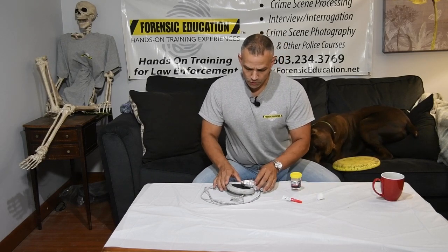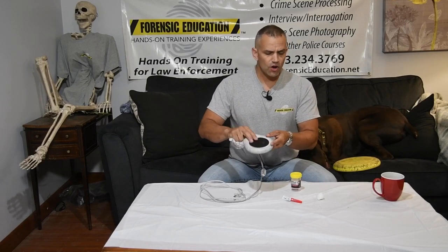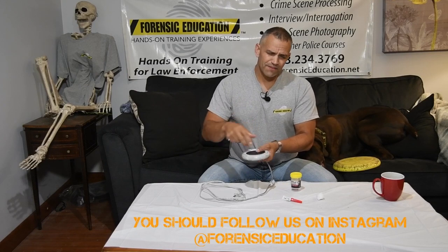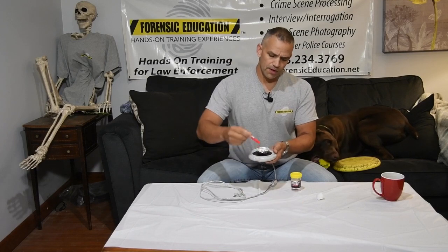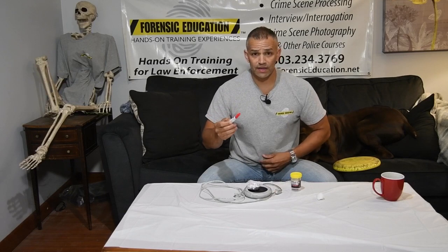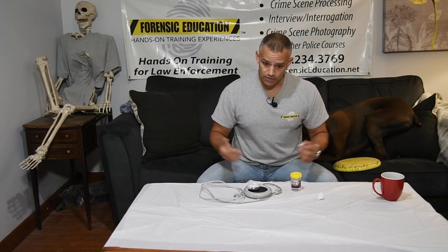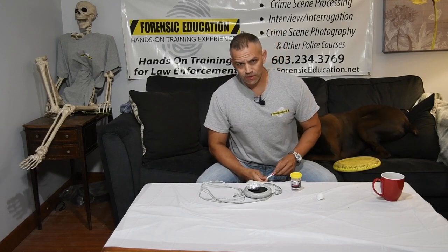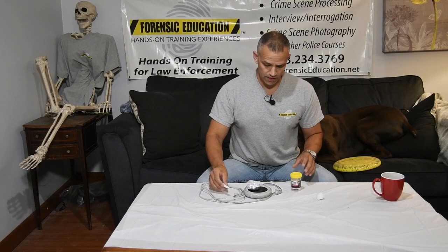Normally when we superglue fume, you would use a coffee cup warmer or candle warmer for mobile fuming. You put your tray on here, put your superglue in, and that heat turns the cyanoacrylate into fumes which stick to your fingerprint. I have lots of other videos on that so check those out if you want to learn how to do that.